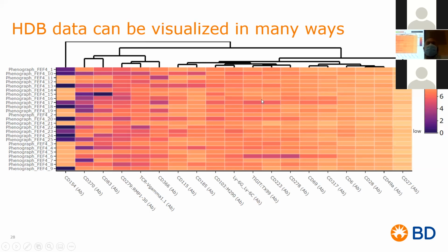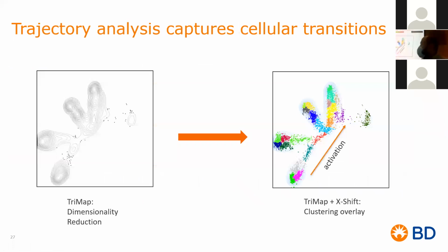Okay. With Violin Box, you can also generate dendrograms on your x-axis. And I'm not showing you on this slide, but then you're able to start grouping the clusters together. And what I saw in my heat map analysis is that the clusters from the bottom left were part of the same group from the dendrogram analysis. So all of this starts coming together again from the circle that I was mentioning. You start going back and forth between your analysis, your dimensionality reduction, your clustering. So you could start at any one part and always end up with more information.